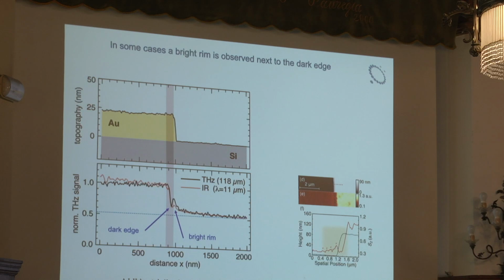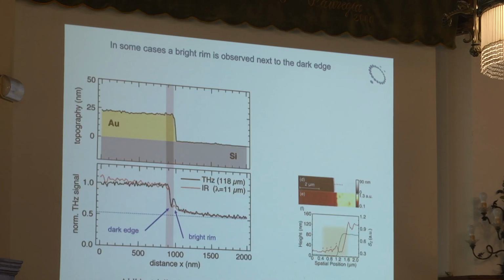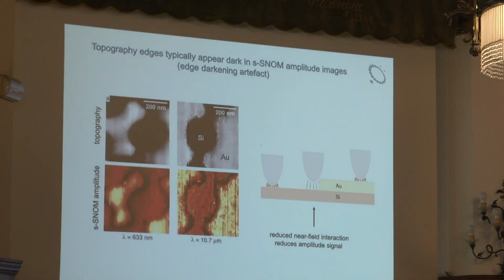So Rainer, in that case, the fringe is always comparable to the size of the tip? Yeah, we will see this later on with the blunt tip example. But here we see only a dark fringe, right? No, not necessarily, because it's a near-field effect, and the near-field is not so much depending on the direction. So you also see it here, right? I mean, it's pretty symmetric. It's really kind of going all around, right?